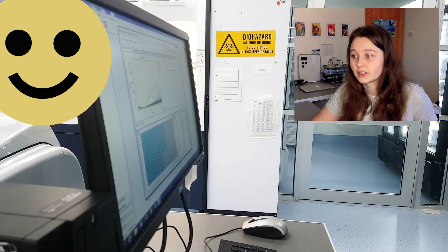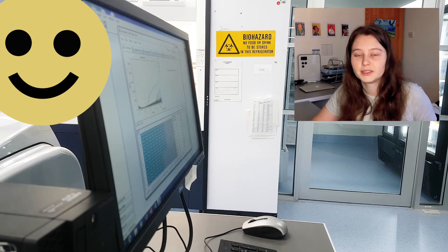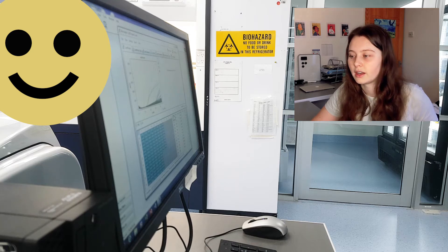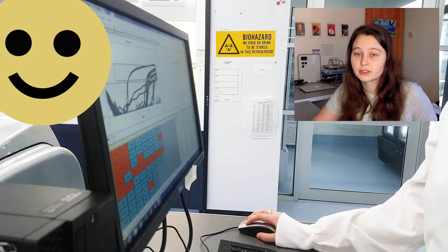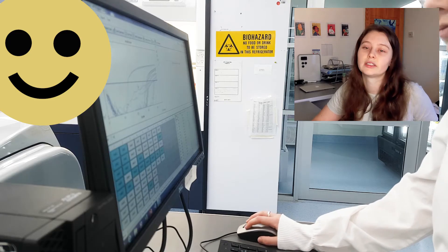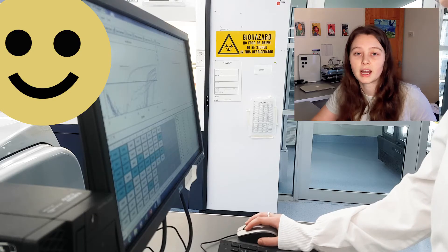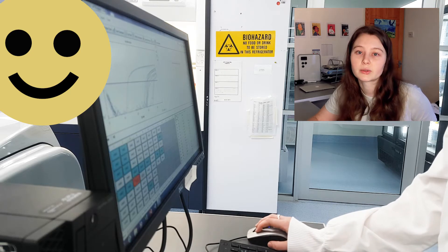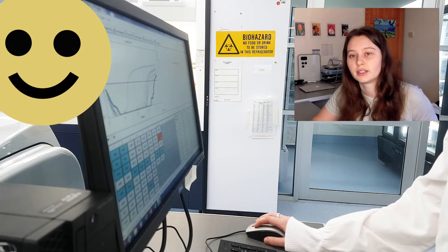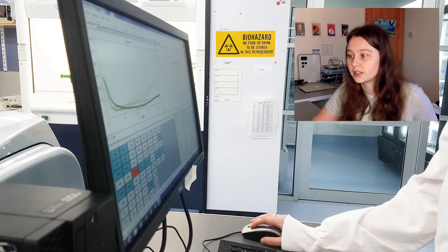So at the end you get your results. Analyzing qPCR would be a whole other video, but you can just see here very quickly I am just checking that my positive controls worked, my negative controls didn't amplify, because either of those things failing would mean I just need to rerun the whole plate. So I want to know that quickly so I can just go straight away and put it on if something has gone wrong. But this one looks pretty good.